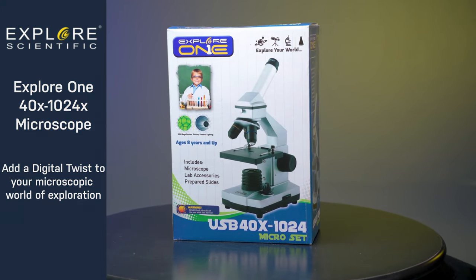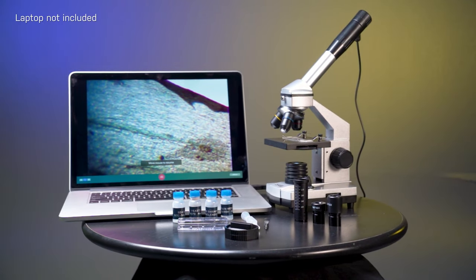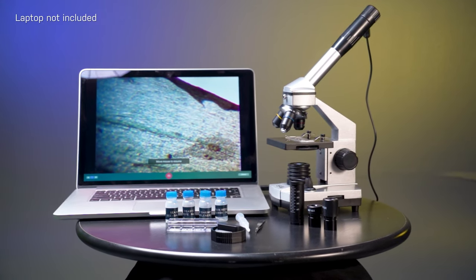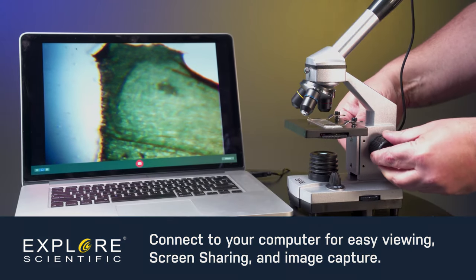The Explore One 40-1024x microscope adds a digital twist to the traditional compound design. Discover even more of the microscopic world with the USB eyepiece by connecting to your computer for easy viewing, screen sharing, and image capture.